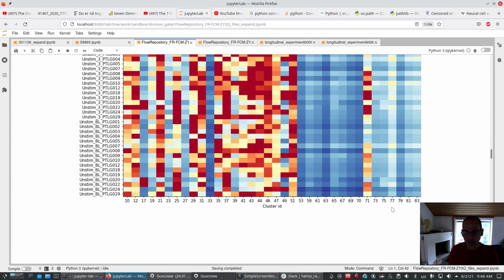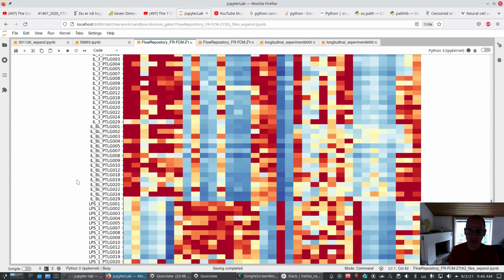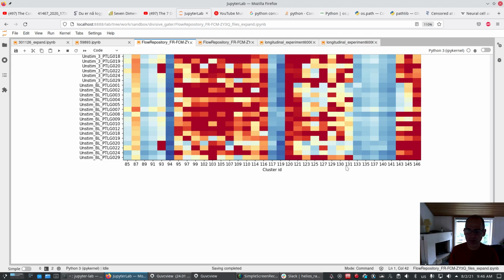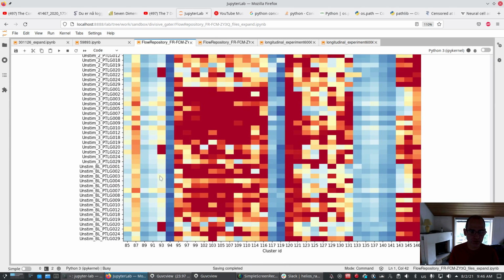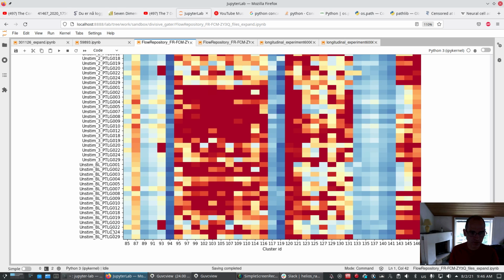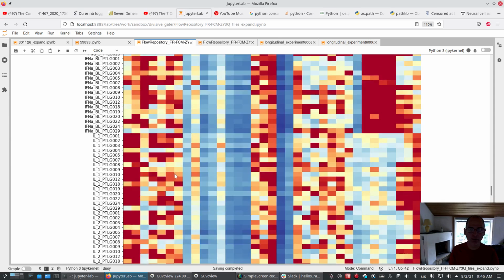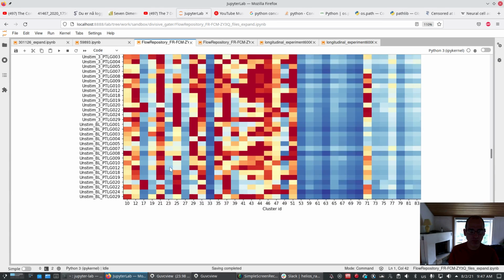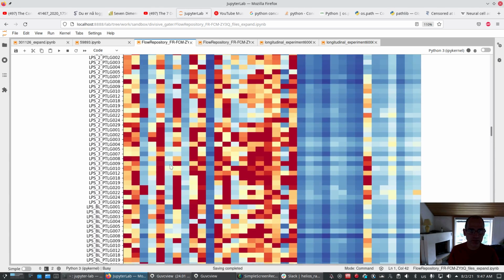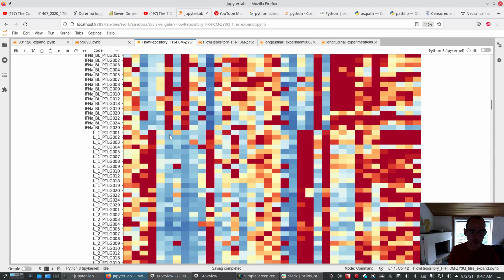And well, here are only some of the clusters. I have made 2 heat maps because otherwise I would not be able to see the names of the labels here. These are the cluster identities. Oh, this cluster, that's special, but maybe it's not so interesting. We see there's something specific for 20 and 22 all the way up. I want to take something that is more like this changing color along the groups of samples, and I think the one I want to dig into is just to do one, is number 23. We can do as many as we like. So 23 is having a transition here.